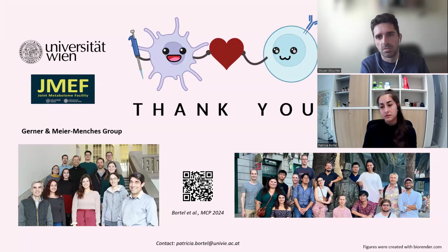So this was all done on automated KingFisher platforms. Yes, exactly. Do you have any tips and tricks if you want to do this workflow in a manual format? I know you've done a little bit of work on that. We can maybe share your experiences. Yes, so we did this back in the Olsen lab on the KingFisher, and then I tried to apply this workflow in our own lab here, and we wanted to do it manually.